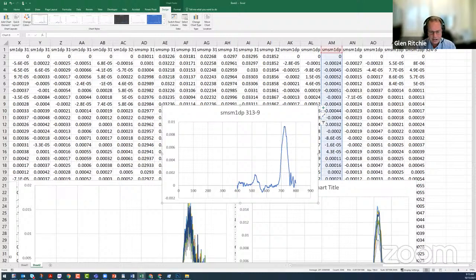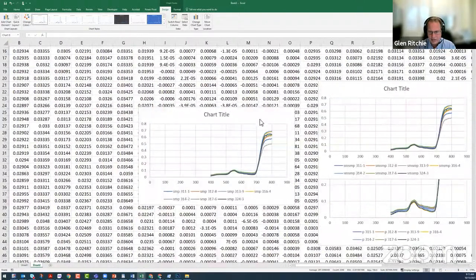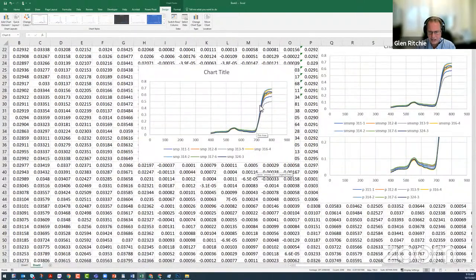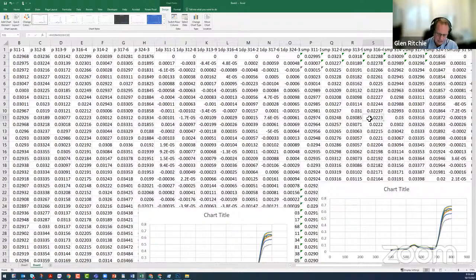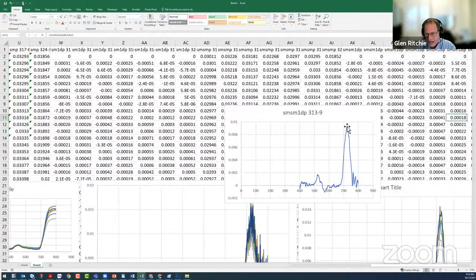This big peak right here corresponds with this spot right here where you have the maximum increase in reflectance between the visible and the near infrared. So you can use this to do a lot of really interesting things, such as, how high does this peak go? Can it shift from left to right? All of those things are measurable, and all of those things have had papers published on them. The answer is yes, you can actually shift the spectrum quite a bit based on your treatment.